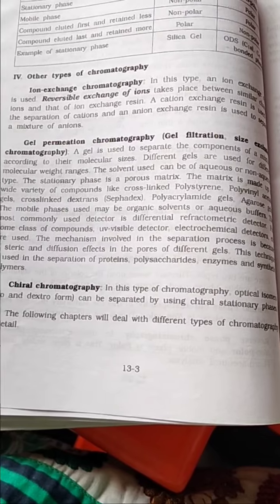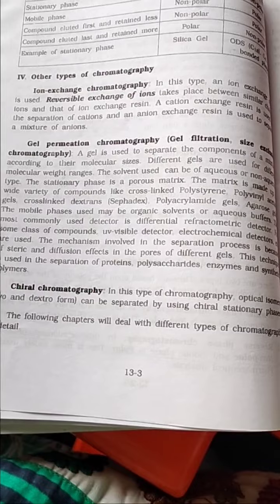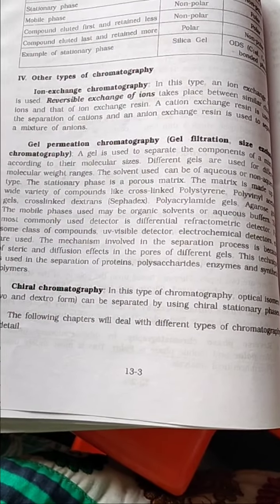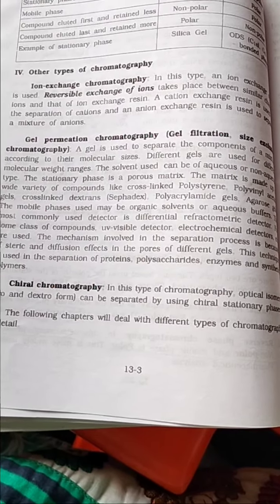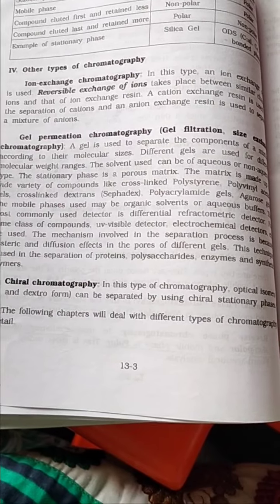We can separate the components by using this gel filtration. Different gels are used for different molecular weight ranges to separate the components in a liquid. The stationary phase is a porous matrix.